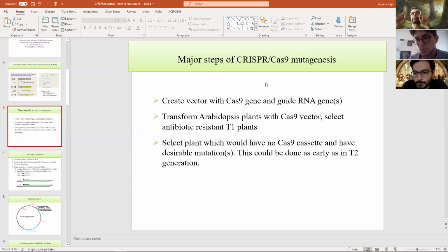And these two regions are about 300 base pairs apart or shorter. The literature says if you attack the gene from two different regions, there is a possibility that a long piece deletion mutation can occur. I forgot the official name for it. So a region will be deleted instead of just one or two nucleotides. Like 300 base pairs will just leave the place, and then the genome will bind together again.